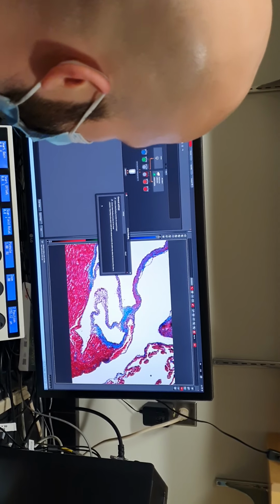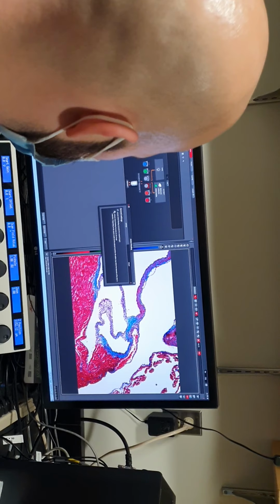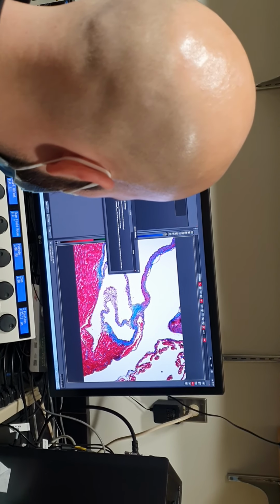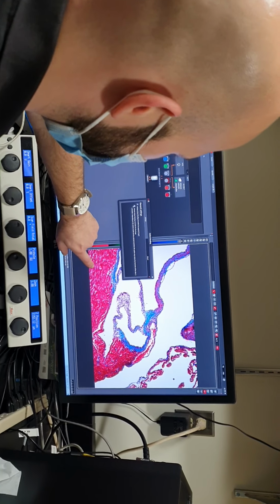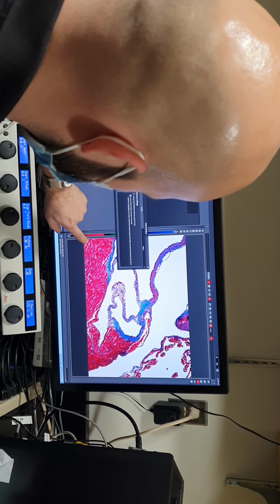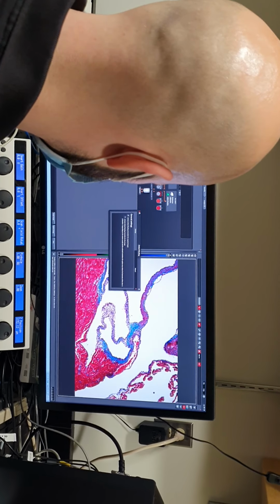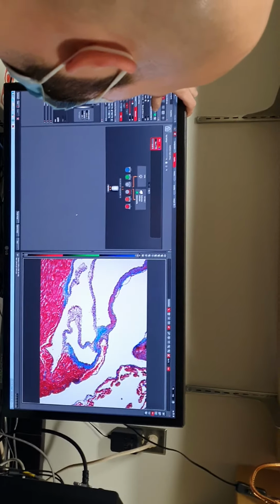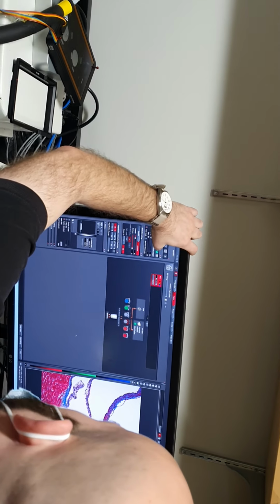And then you can either do it just on the acquired images or also on the live images. I usually turn it off for the live images and just have it on the acquired images. But you can see if we turn this on and off, if it's off, there's no shading correction, and then you turn it on, you can see it's brightening up the corners of the images. And then if we have our reference image, this turned from gray to green, saying that we have our reference image to use now.